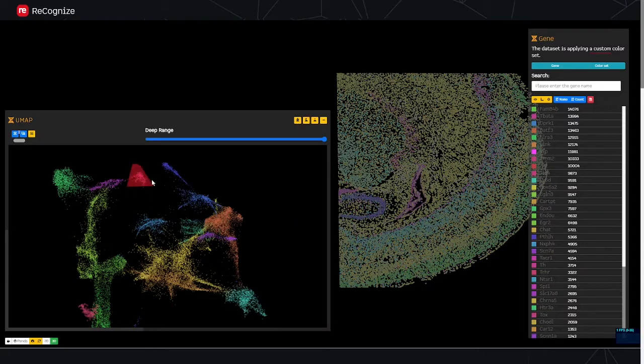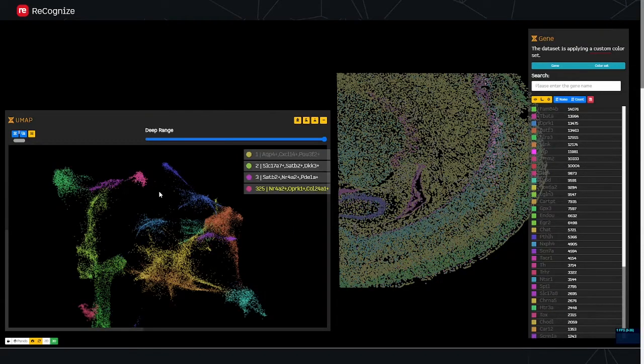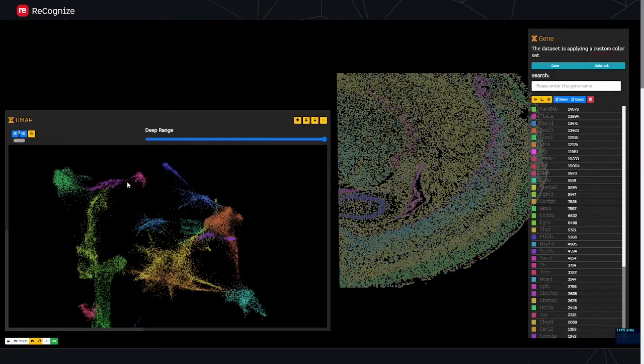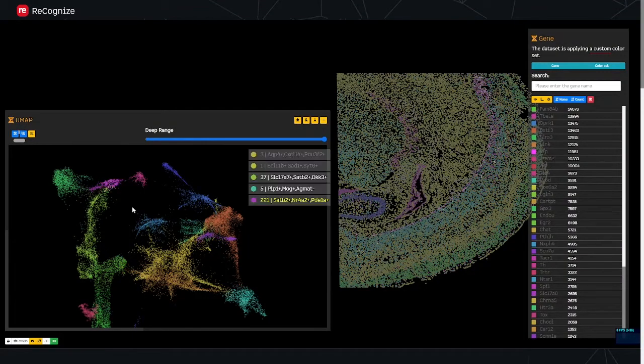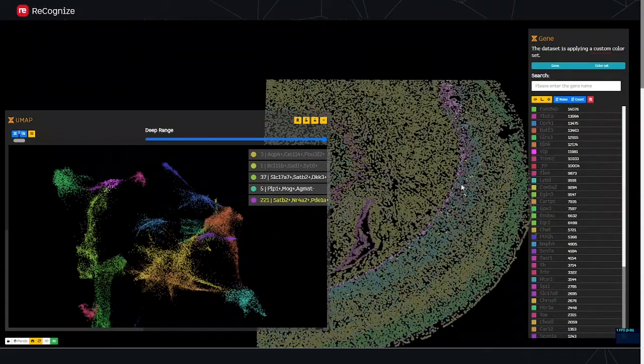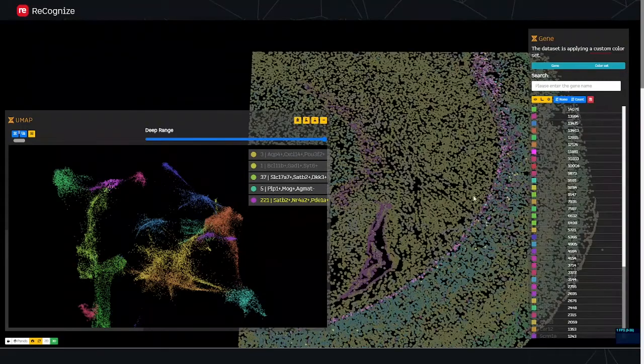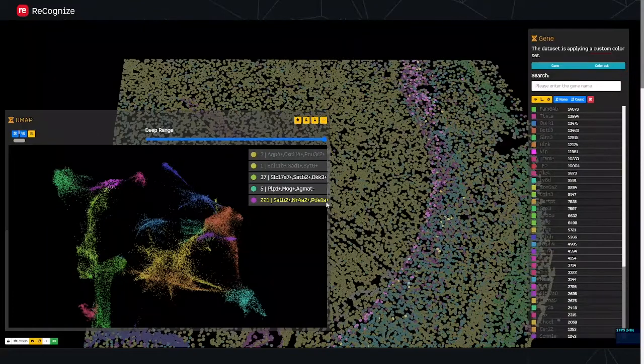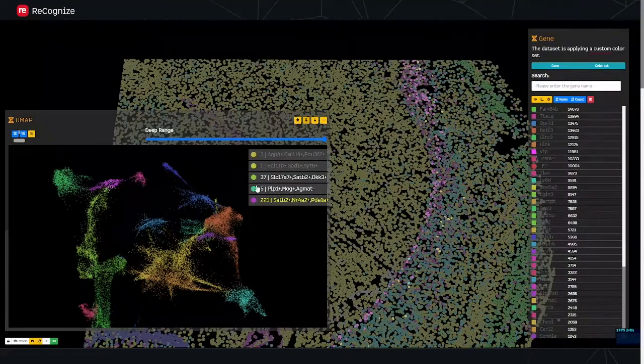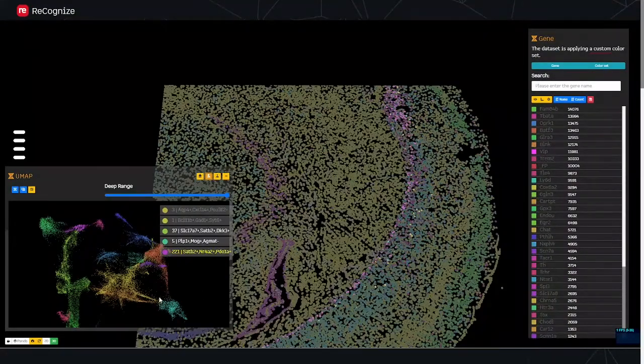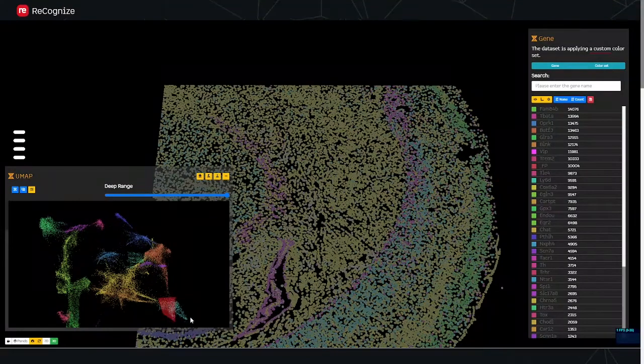For example, this little cluster here with these reddish cells is one of the outer layers in the cortex. And the neighboring cluster is actually the cells right at the layer boundary.